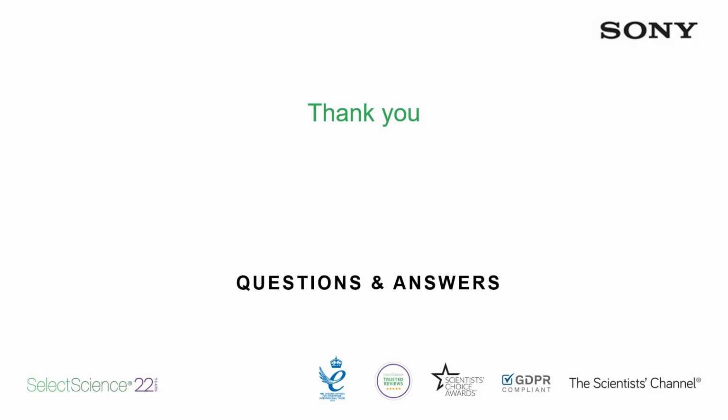Great, thank you for that answer. Yep. So moving on to our next question here, we have, how do we clean the chip between sample types?